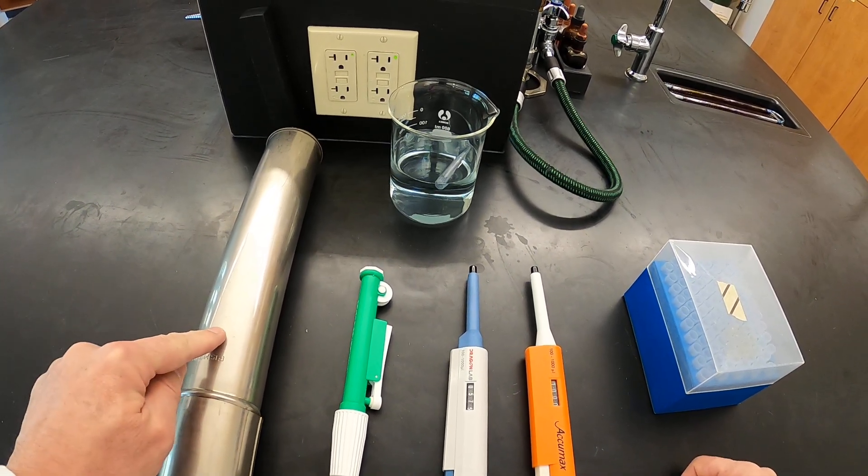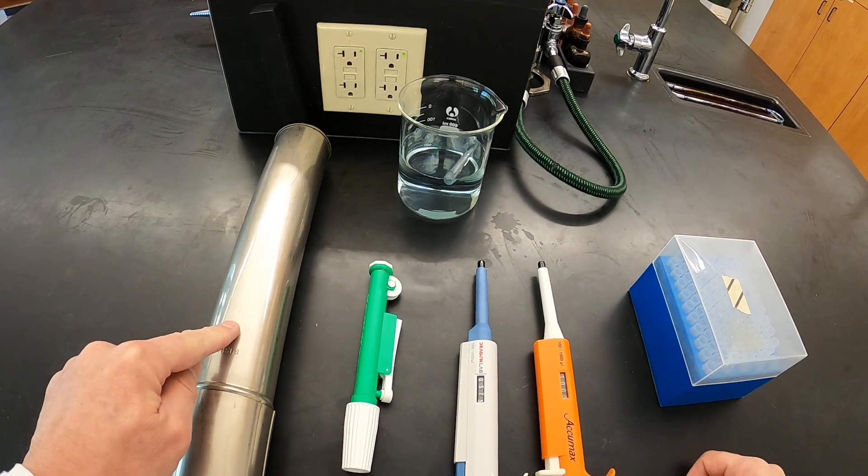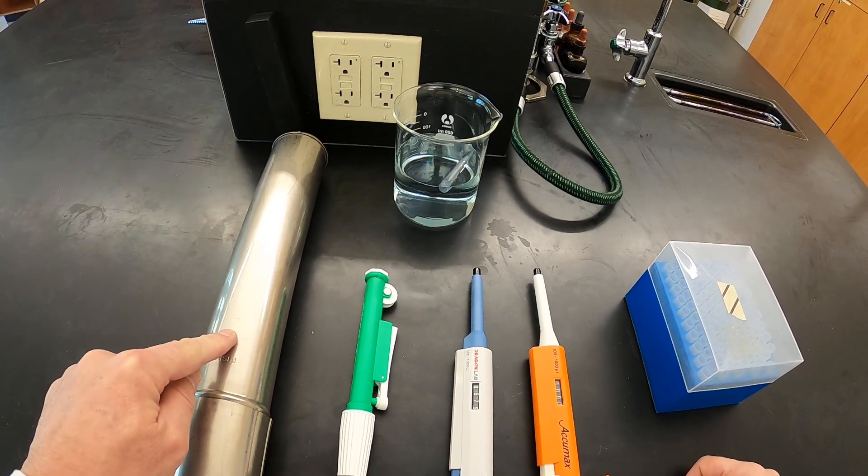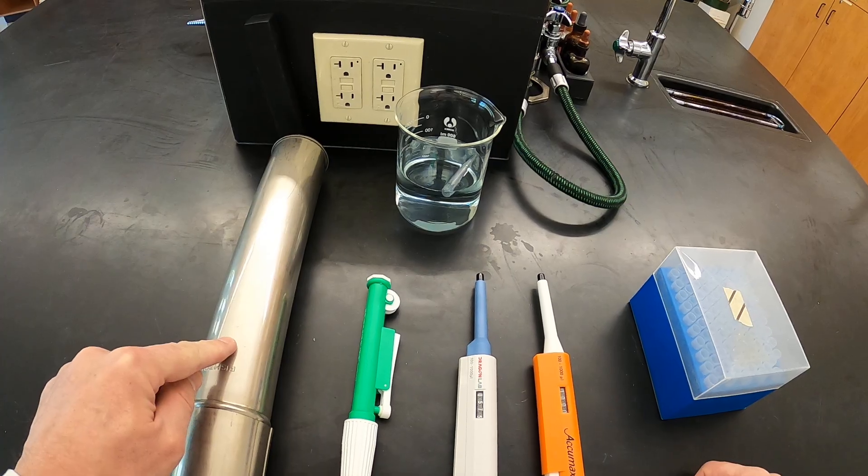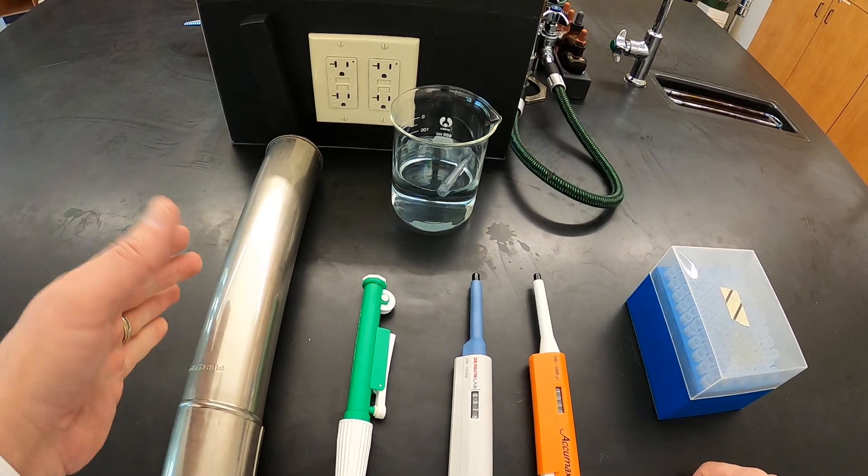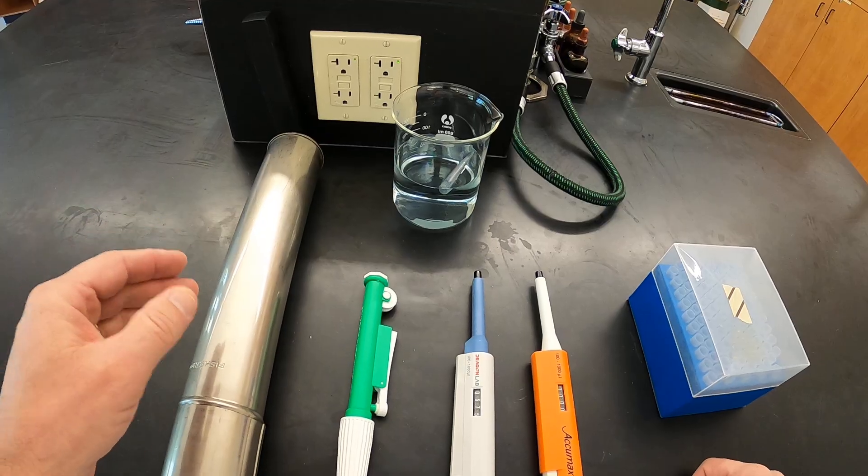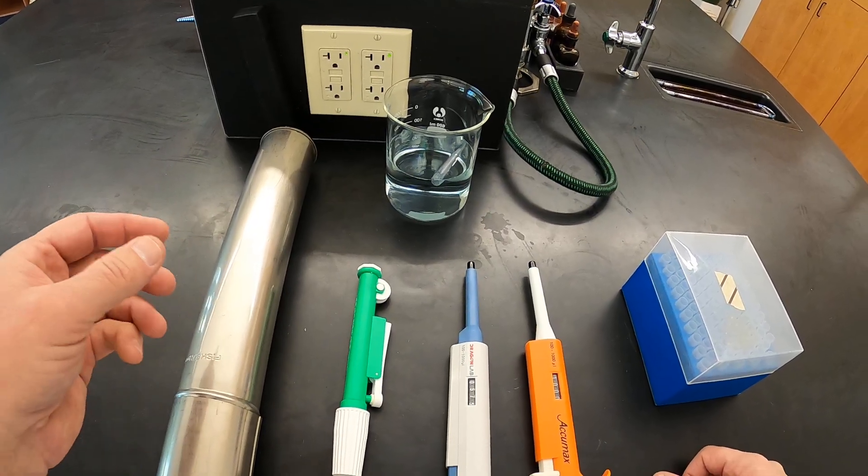The first type of pipettes are going to be stored inside of a sterile container like this one. This particular one has not been sterilized, but I'll show you how to take the pipettes out once it has been.